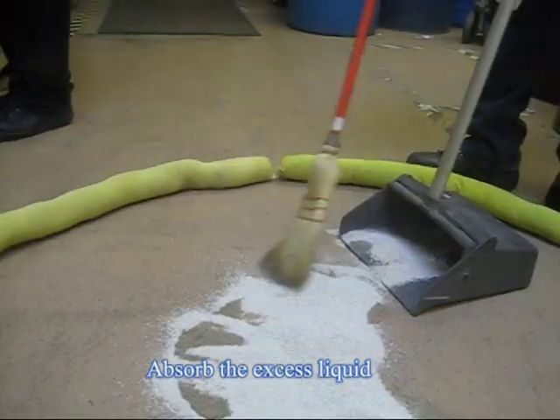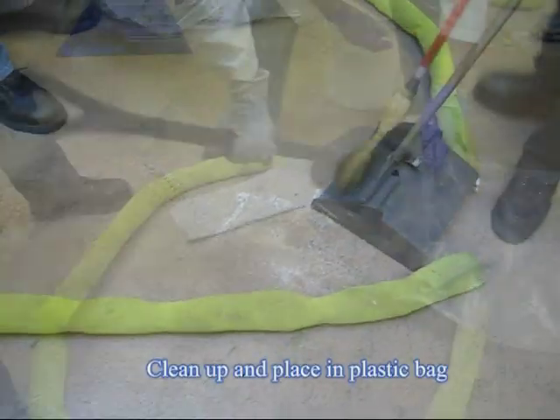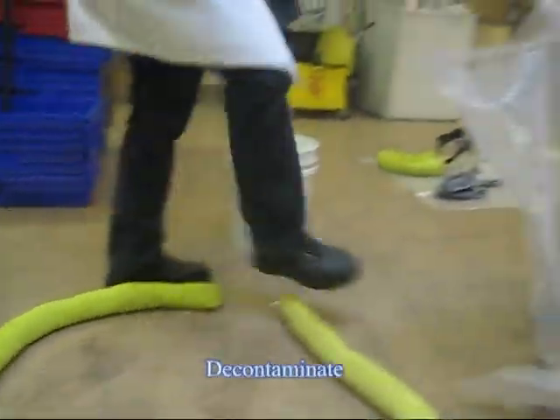Then absorb the liquid using universal spill pads. If available, you can also use vermiculite or clay to absorb the material. Finally, clean up the materials using a simple broom or brush with polypropylene bristles and place everything into a plastic bag. When all is cleaned up, make sure to properly decontaminate, dispose, and document your work.